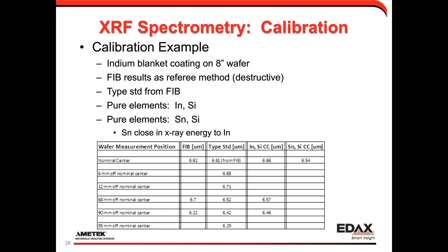So what I'm getting at is that there is more error associated with the focused ion beam measurement than I would have originally thought. I'm getting more of an average value using the X-ray, and I'm going to get more fluctuation in what I see in the focused ion beam measurements.